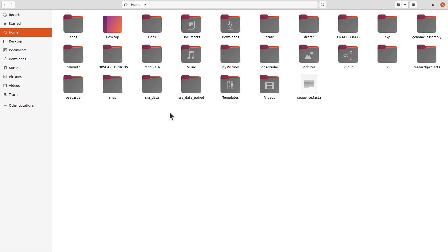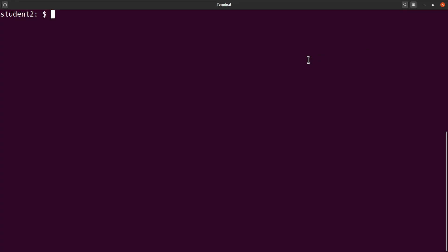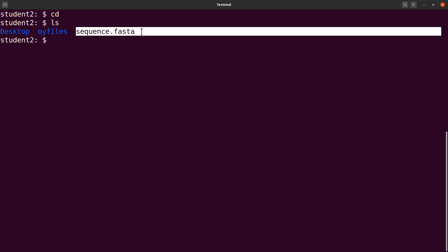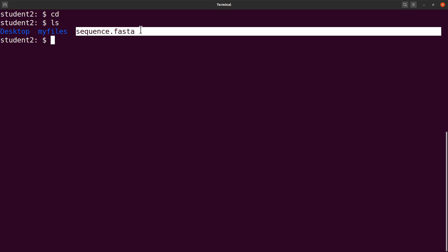If I go to home directory, notice the file is here. That's the file I need. I'll just go to the terminal and proceed from there. Because I saved it in my home directory, I just need to do a cd. And then when I do an ls, I'll see the FASTA file there. It's called sequence.fasta. That is what I'm going to use.